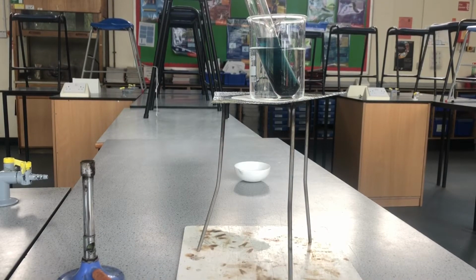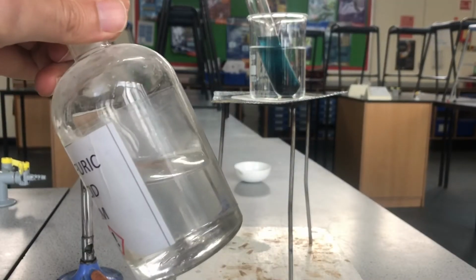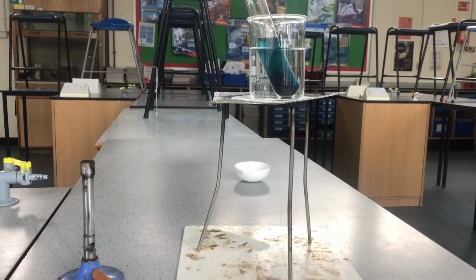So the water was plenty hot enough in the beaker, so I've turned the Bunsen burner off, and you can see the copper oxide starting to settle out a little bit now. We can start to see an observation that whereas we started with sulfuric acid, which was entirely colourless, and copper oxide, which was black, we can see now the copper oxide settling in that boiling tube, and the colour seems to have turned blue. Now, copper sulfate solution is blue, so that observation entirely matches the theory that we're expecting.